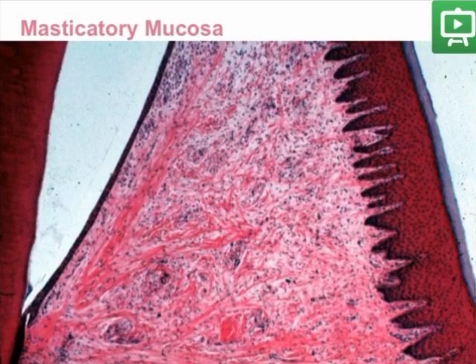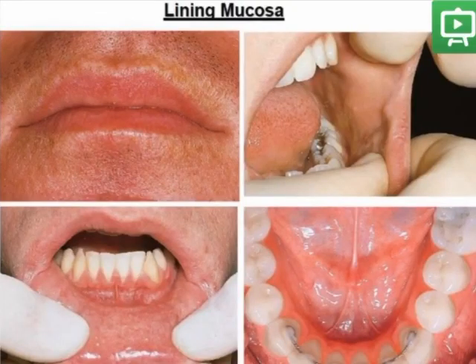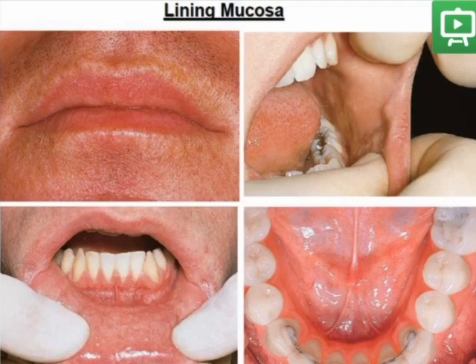Again, a keratinized epithelium and a thick lamina propria are visible in the masticatory mucosa sections.